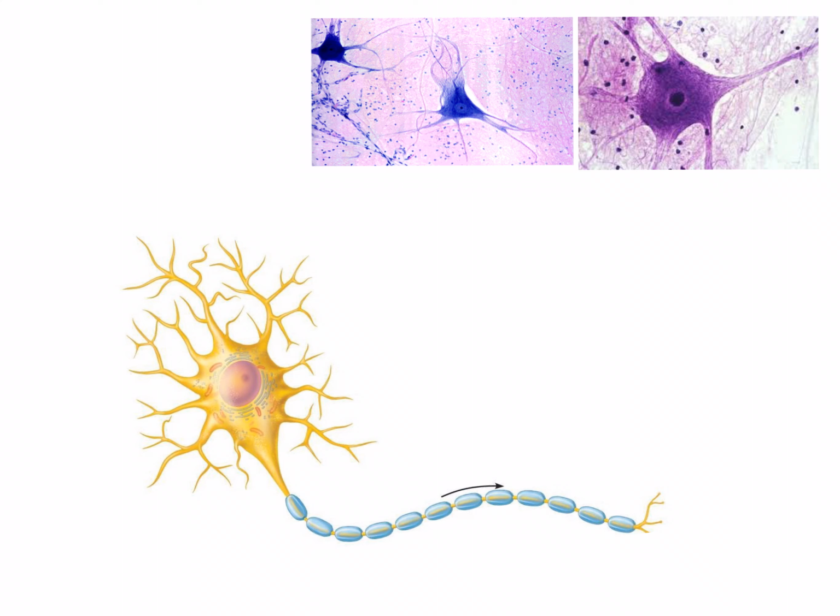We start off with these processes at the topmost image, and these are called dendrites. Dendrites are used by the neuron to receive information from surrounding neurons or surrounding tissue, following which we have the nucleus within the cell body of the neuron. Is there another name for the cell body? Yep, it's also called the soma, S-O-M-A.